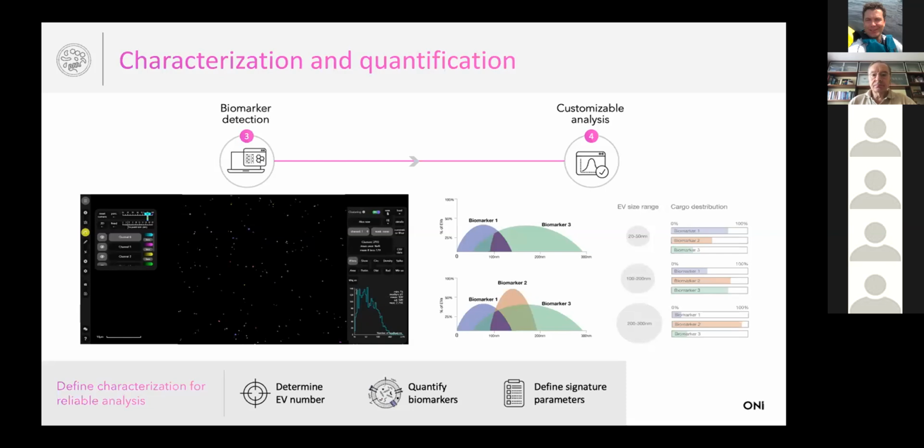So now all of a sudden we can start to consider the particular parameters of the clusters that we're interested in and base that on localization numbers. We can look at area sizes, we can measure the densities of these. And the best part is then we can save these constraints or filters and we can apply them across multiple data sets. This allows us then to consider the spatial distributions as well as the arrangements using established algorithms.